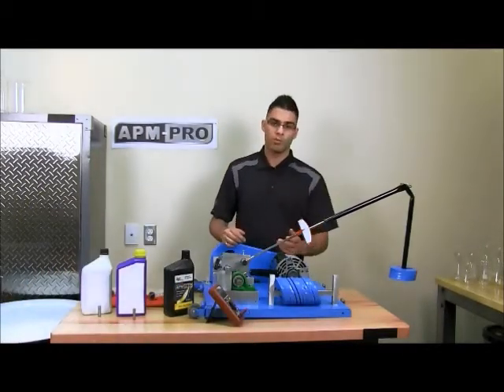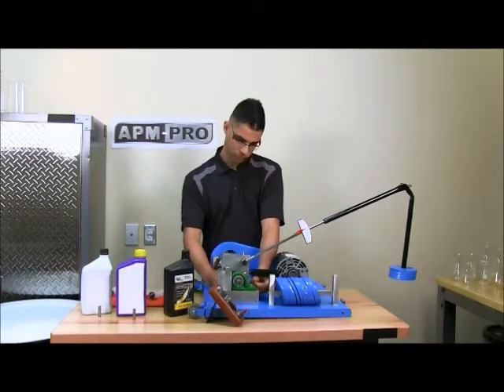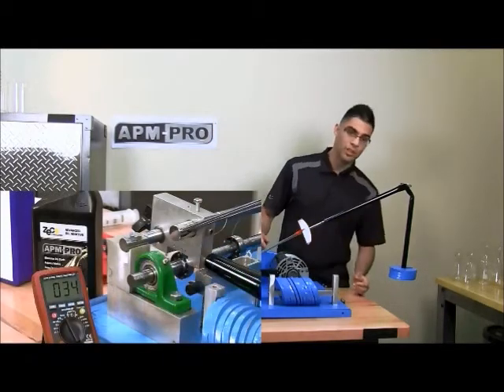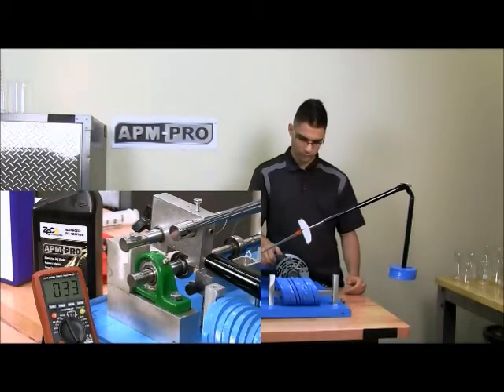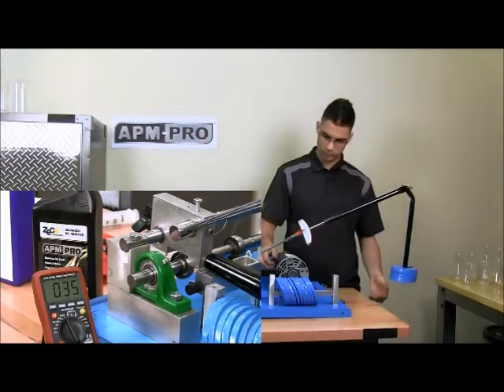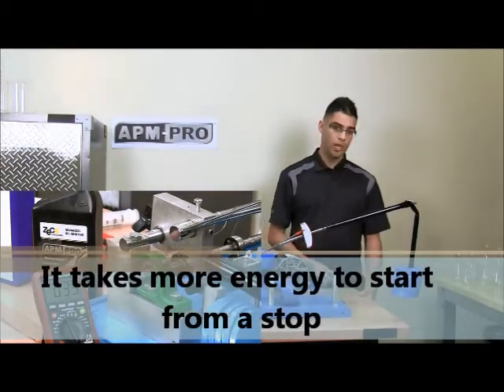Now I will remove the oil bath to simulate dry starts. We will begin the dry starts at four weights. It stops at eleven weights.